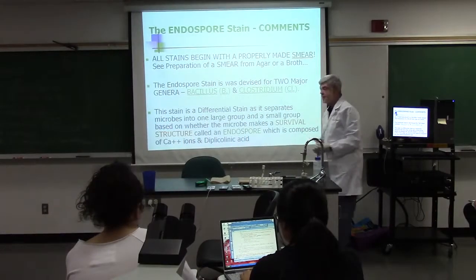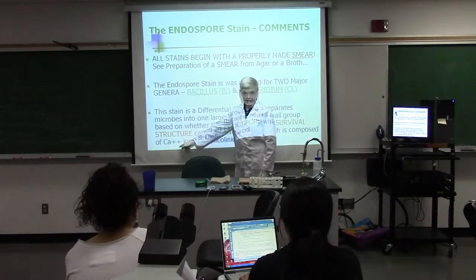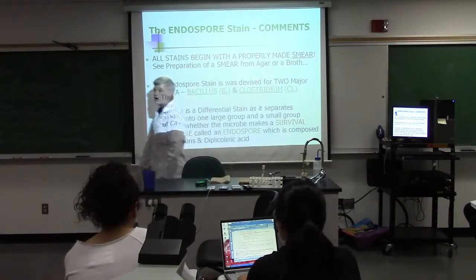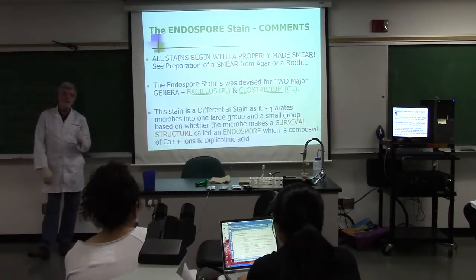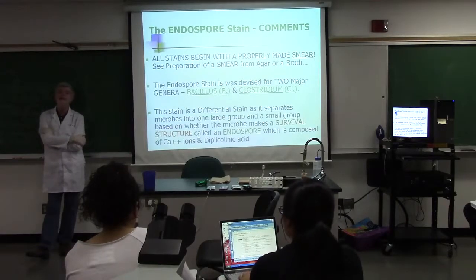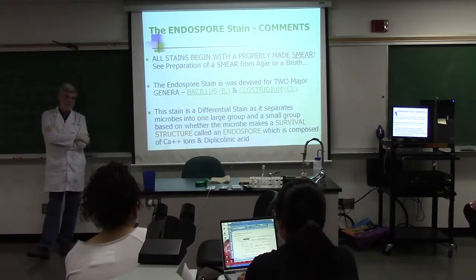Okay, so anyway, the key thing that we're looking for in the chemistry is calcium ions. And since cotton has calcium ions, if you drop this malachite green on anything with any cotton in it, it will never, ever, ever come out. Ever. Longer than marriage.